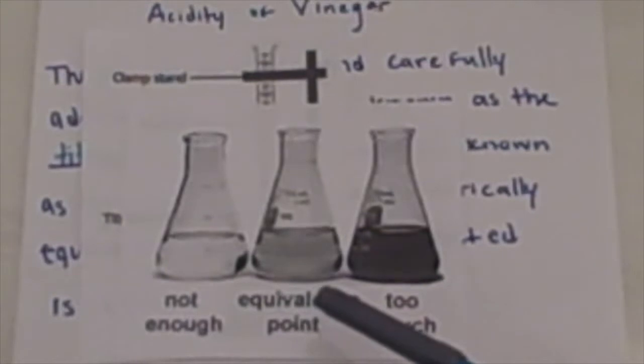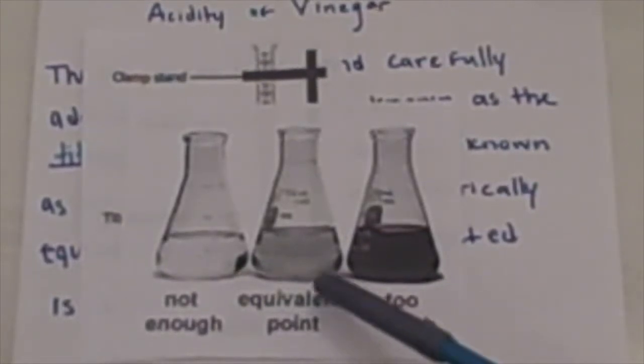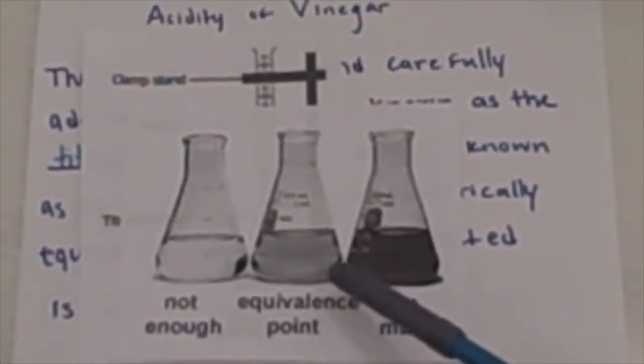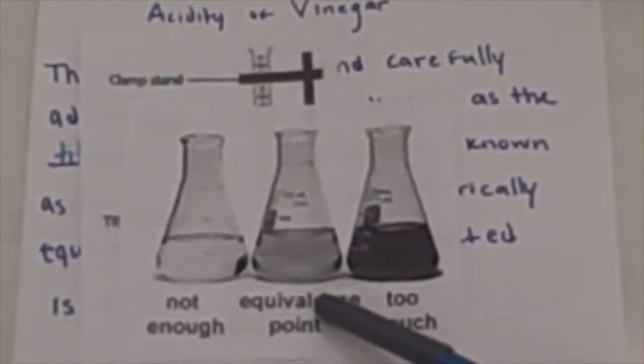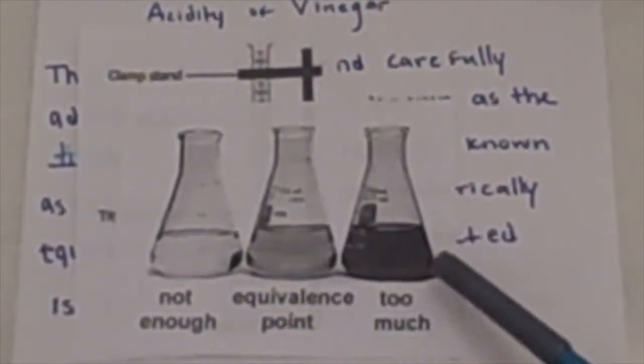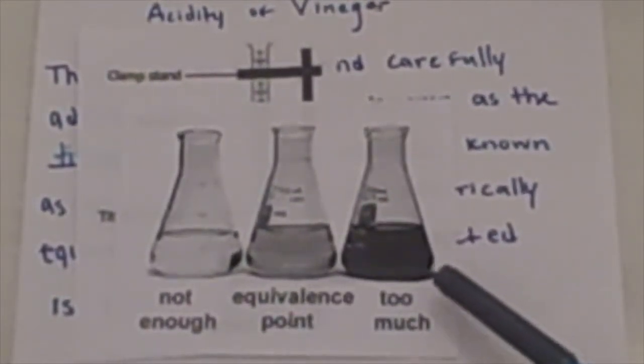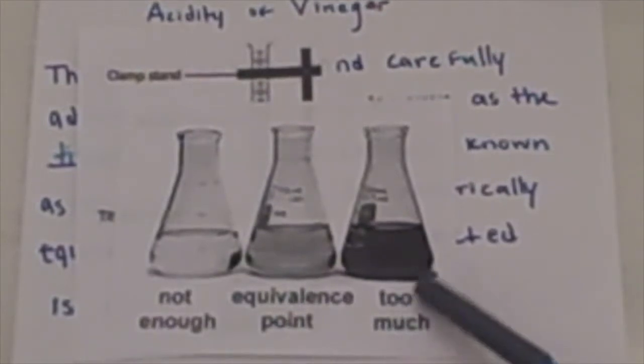You're going to be stirring it. It's going to be changing. Then once that color change stays, then you know you've hit the equivalence point. If it's too dark, like this sample here, then you know you've overshot it and you've far passed the equivalence point.